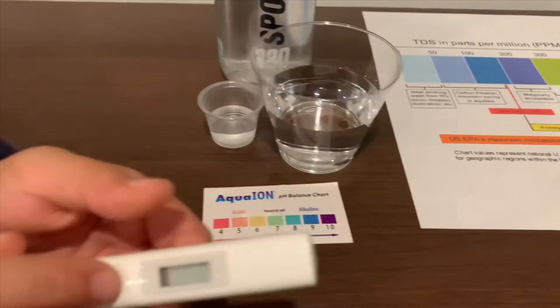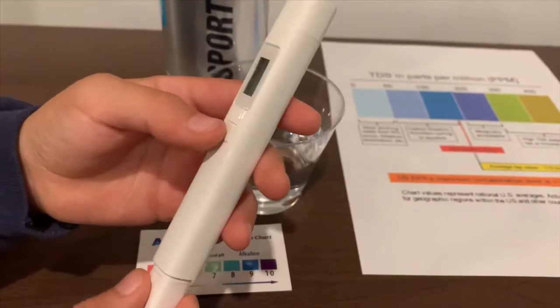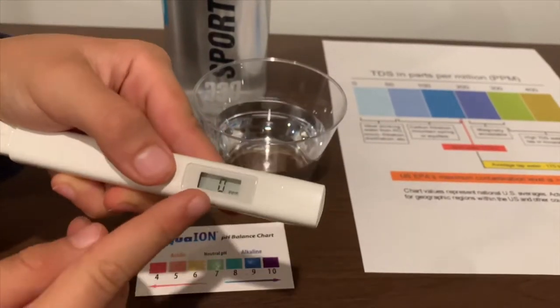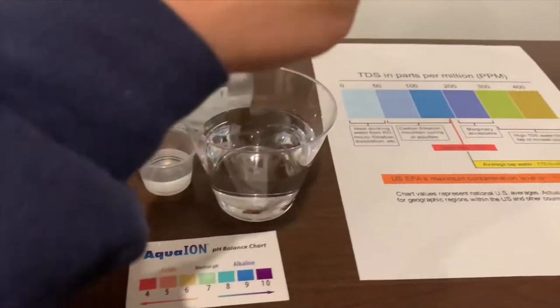First we're going to test the TDS level. If you want to buy this TDS tester, check the link down below. Turn on the TDS tester, make sure it says zero, and let's put it in.